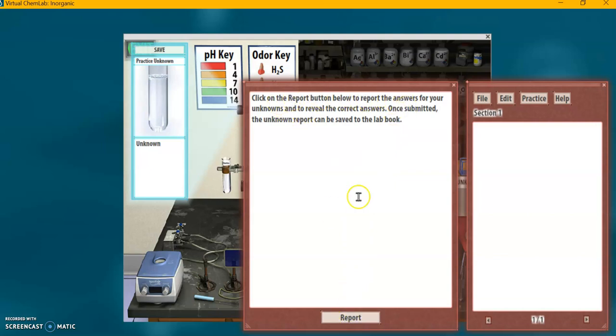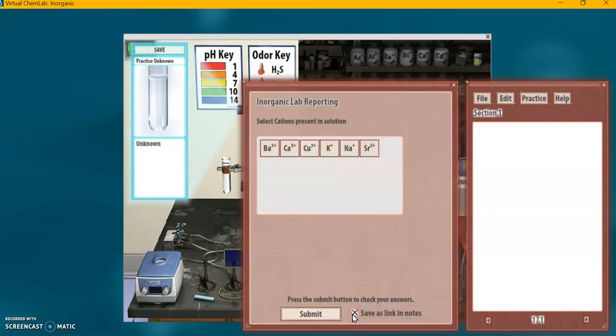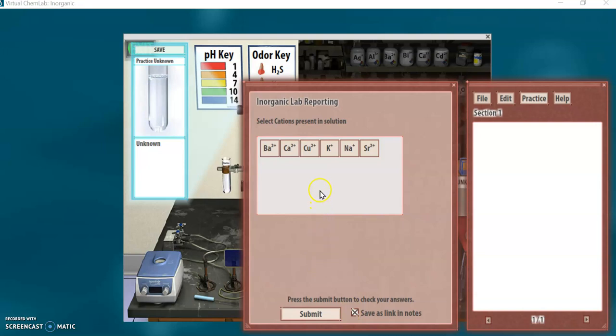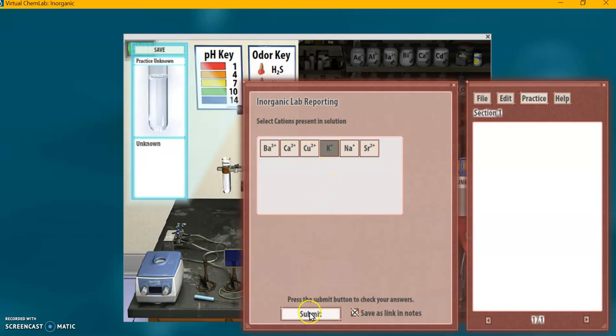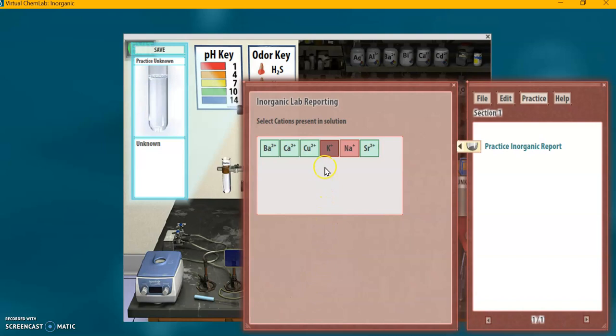This is where we make our educated guess as to which of those six ions was in that unknown test tube. Let's see, I think it was, I'm going to click on the potassium, that's what I think it was. I have no idea if that's right, but let's click submit and see what happens. Oh. Okay, so it looks like I got it wrong. The red ones show what is wrong. It means I did not get the right one.